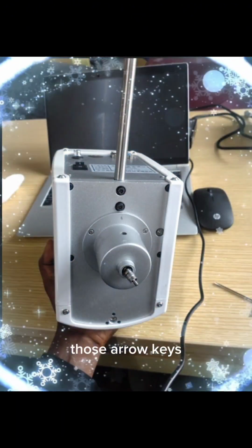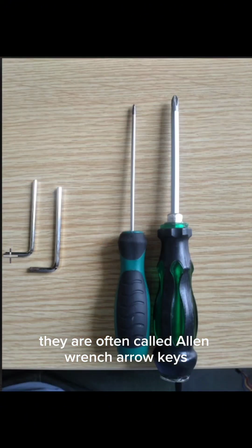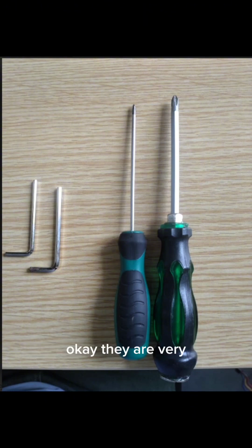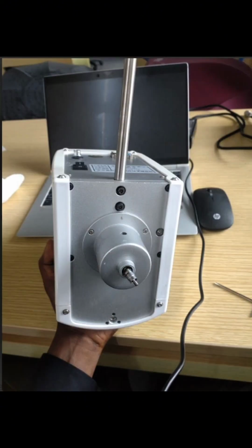Those are often called Allen keys, sometimes Allen wrench. They are very essential while maintaining this viscometer.